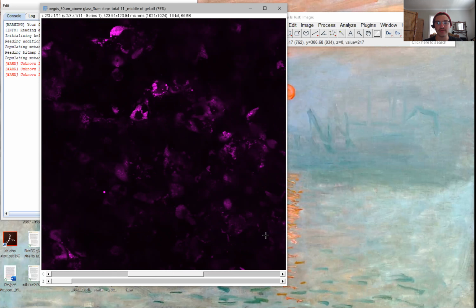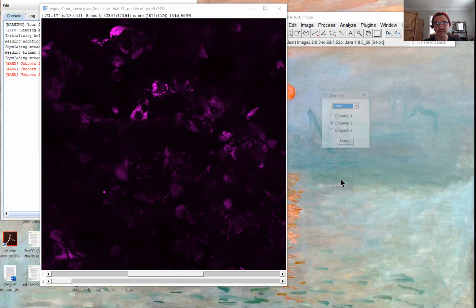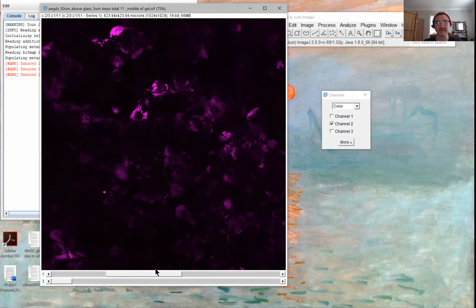And there's 2 ways you can do it. You can use the keyboard function, which is Control-Shift-Z, and it pulls up the color. And then you can pick composite, which brings all the channels together. Color, which keeps it at this individual channel, and then you just have to keep sliding the bar. And then there's also the grayscale, which is pretty self-explanatory.